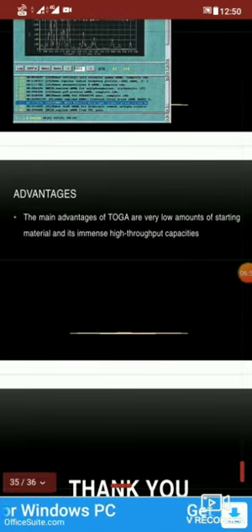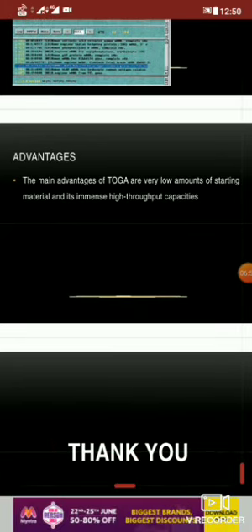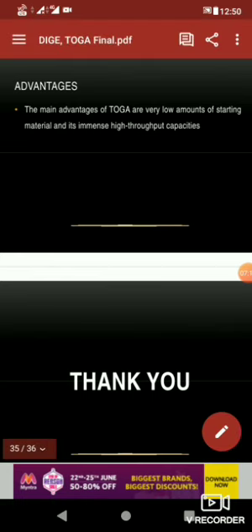And one of the main advantages, as I have already told you, is that a very low amount of starting material is required and you get very good results, which are repeatable and can be easily understood. So with that we complete TOGA. Thank you.